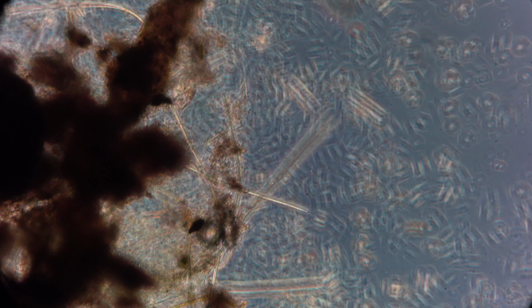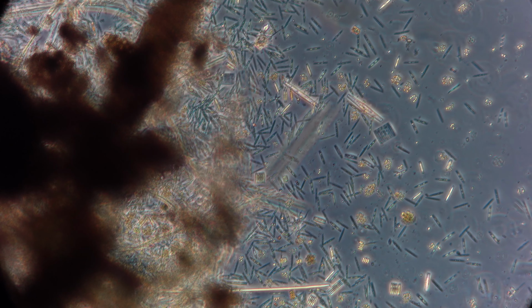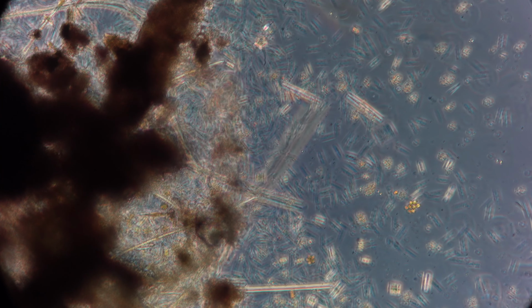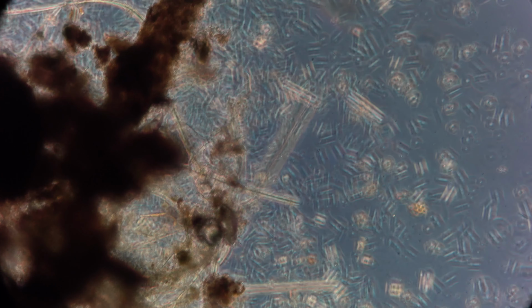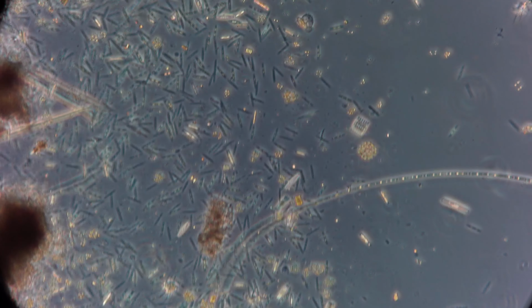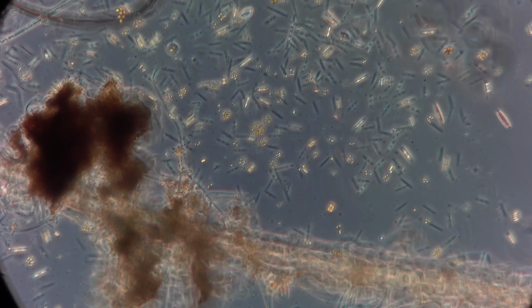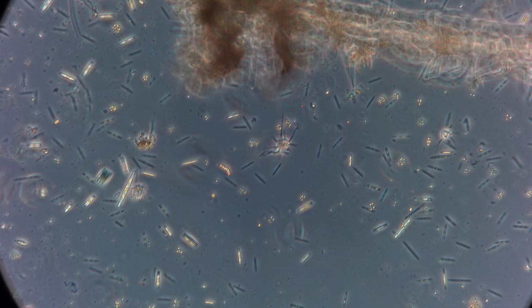Rotifers could be really cool in time lapse if you get one feeding, because they make these feeding currents, and it swirls, you get these currents. It's really cool, but I don't think these guys are feeding. Yeah, but there's a zillion types of rotifers. When they're feeding and swirling, is it like their insides almost swirl? That too. But so many amoebas.